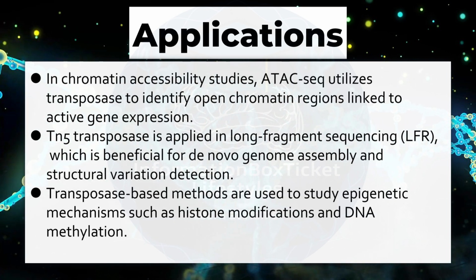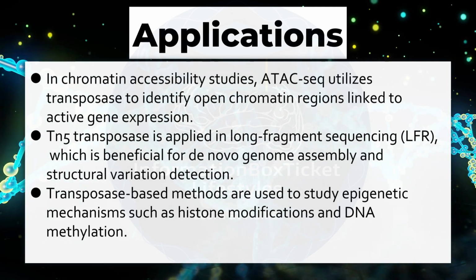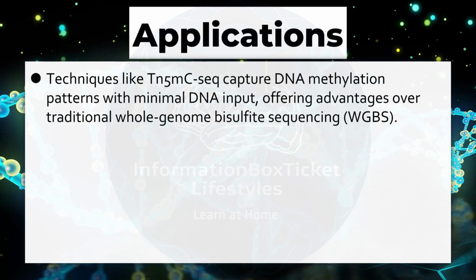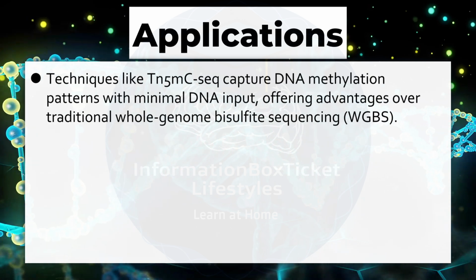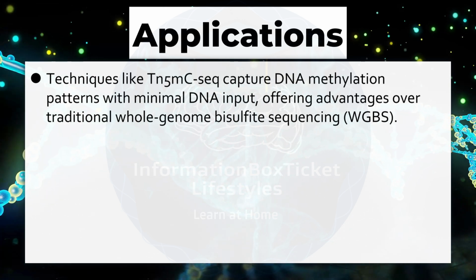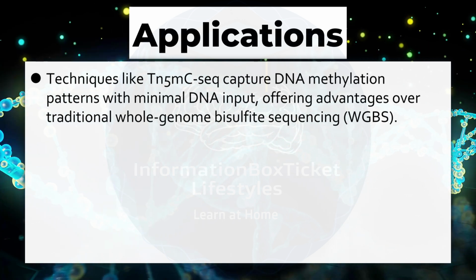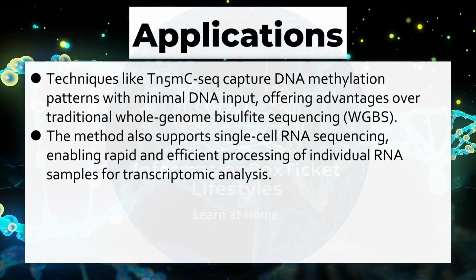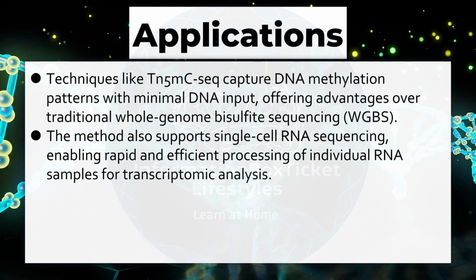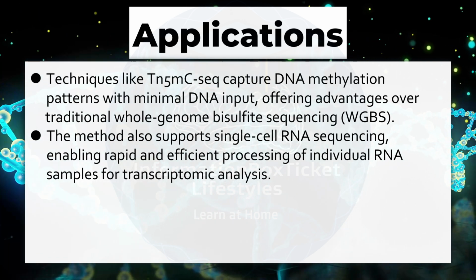Transposase-based methods are used to study epigenetic mechanisms, such as histone modifications and DNA methylation. Techniques like transposase-mediated DNA methylation sequencing capture DNA methylation patterns with minimal DNA input, offering advantages over traditional whole genome bisulfite sequencing. The method also supports single-cell RNA sequencing, enabling rapid and efficient processing of individual RNA samples for transcriptomic analysis.